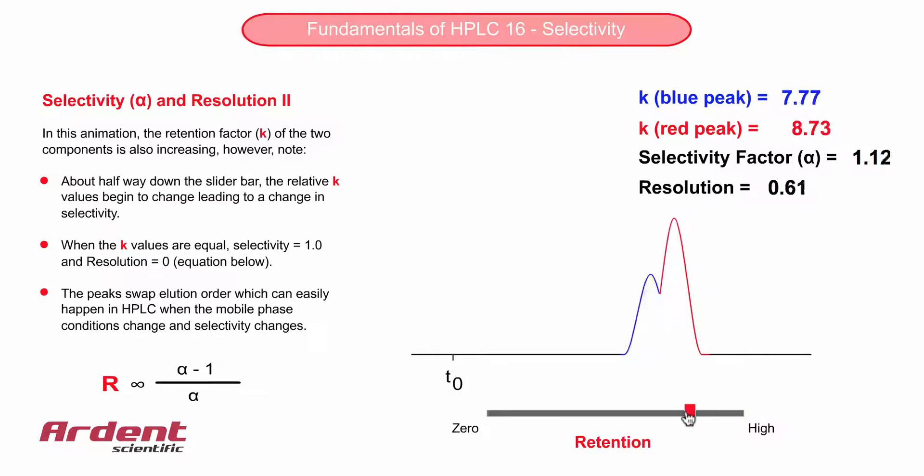As the peaks overlap or co-elute, the selectivity value alpha is 1. This makes sense, because if the retention factor values are the same, then there is no selectivity and resolution is zero.